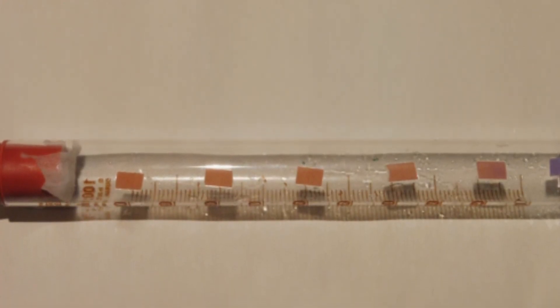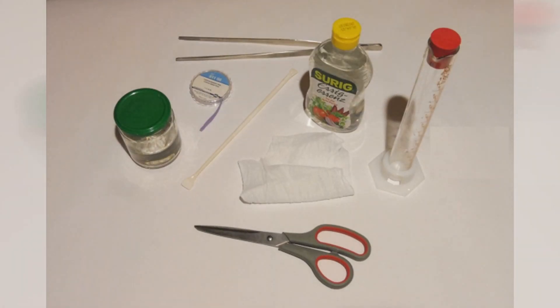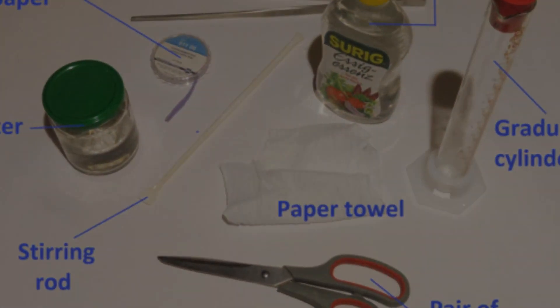Let's now prove our prediction experimentally. For this experiment, we will need the following materials: blue litmus paper, vinegar which is going to be our acid, graduated cylinder, paper towel, stirring rod, water, a pair of scissors, a timer which is not in the picture, and tweezers which might be useful.